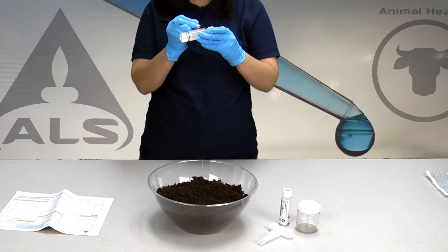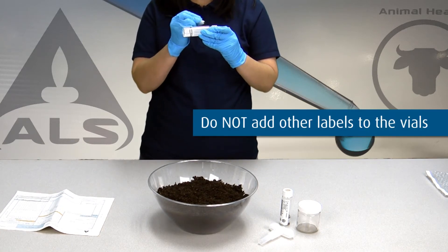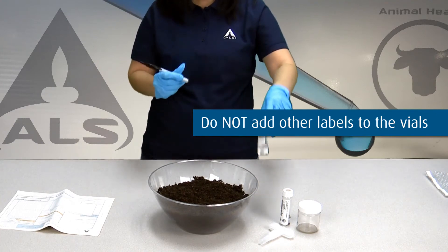Then complete each pre-labeled vial with an appropriate pen. Do not add other labels to the vials as it will alter the tared weight and slow down processing at the laboratory.